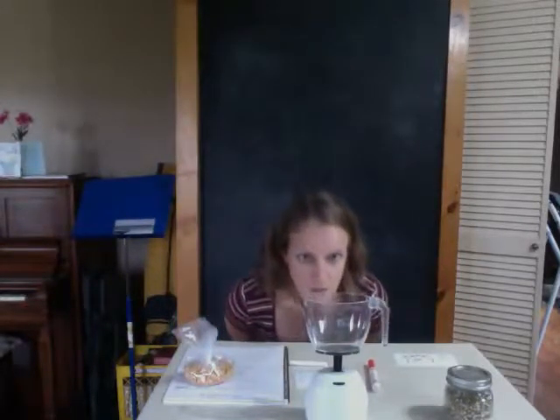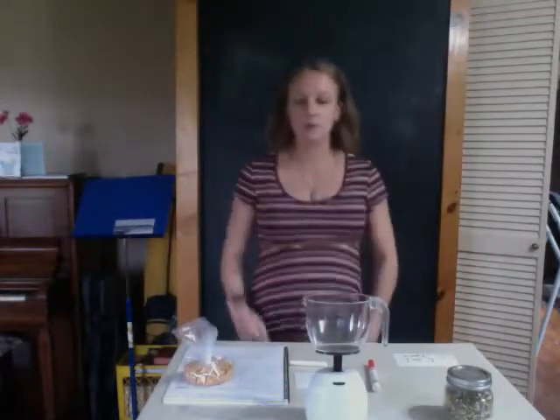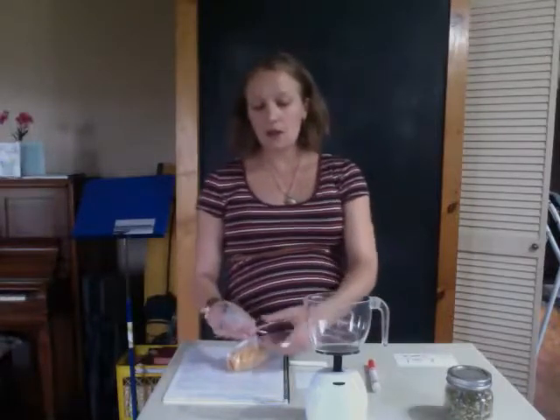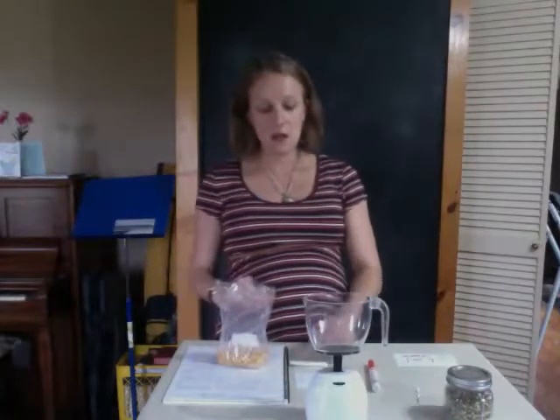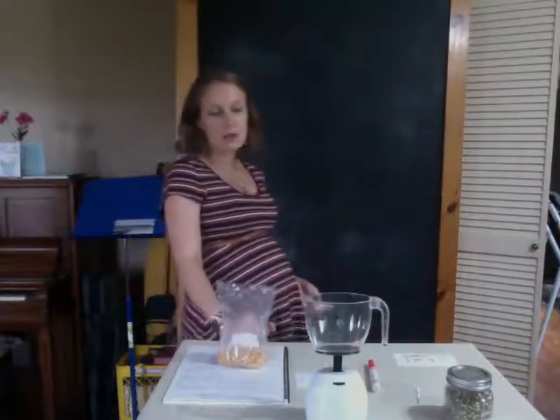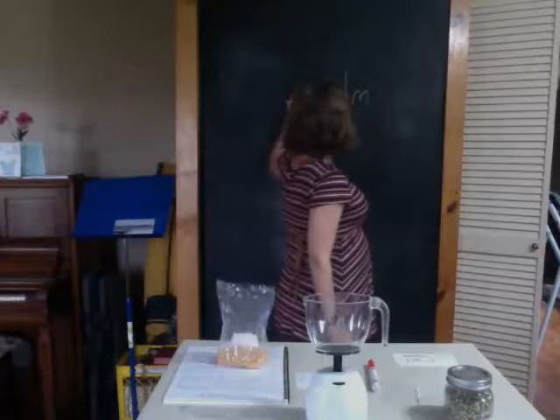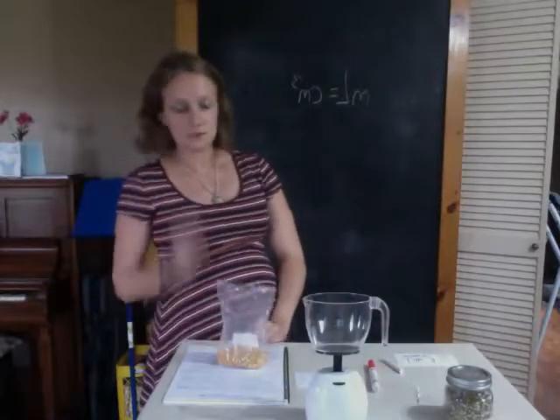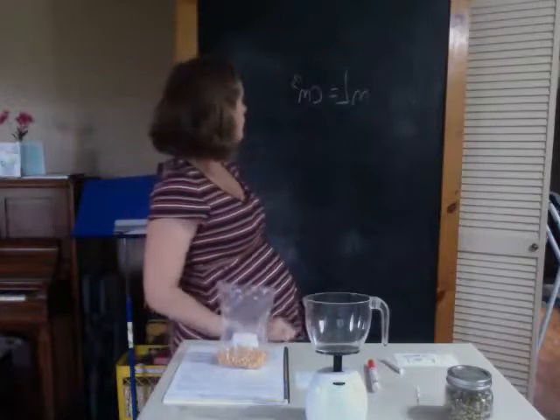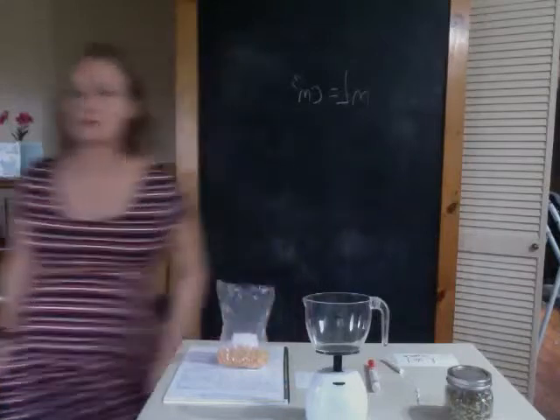Now, I'm going to measure out, let's say 100 milliliters for this sample. A milliliter is also equal to 1 cubic centimeter, so you're going to probably see that. And when we talk about solids, cubic centimeters are usually what we use instead of milliliters. So remember this throughout the course. 1 milliliter equals 1 cubic centimeter. And that's how we speak about solids. I'm realizing this may show up backwards on the screen.